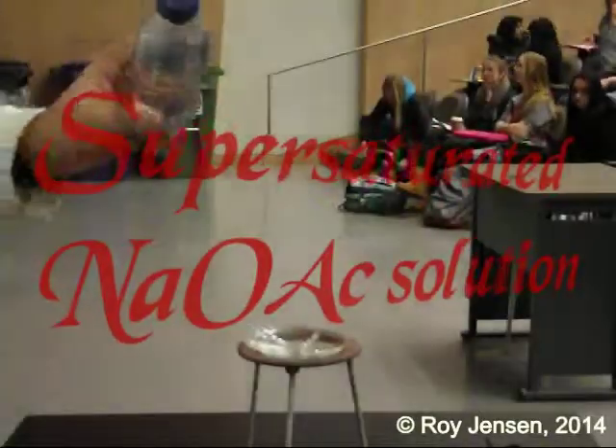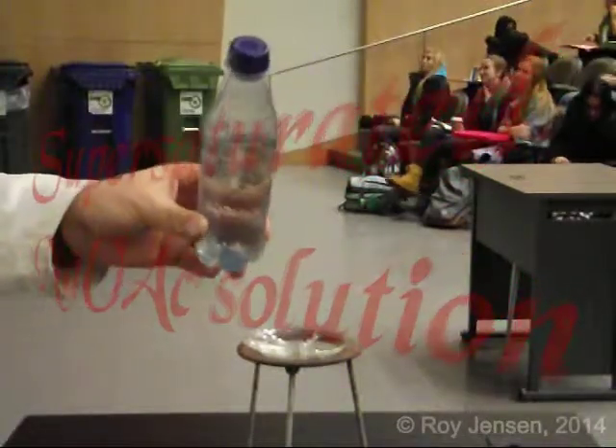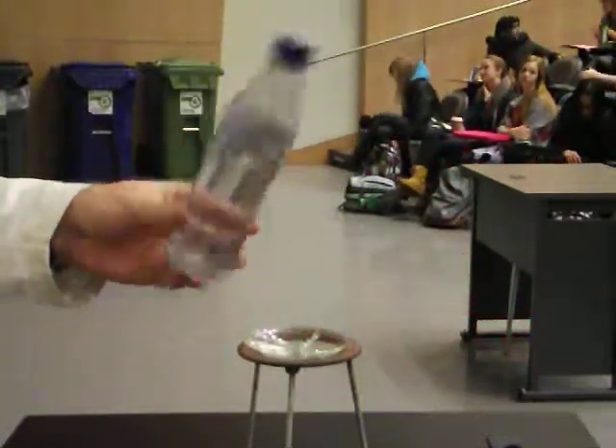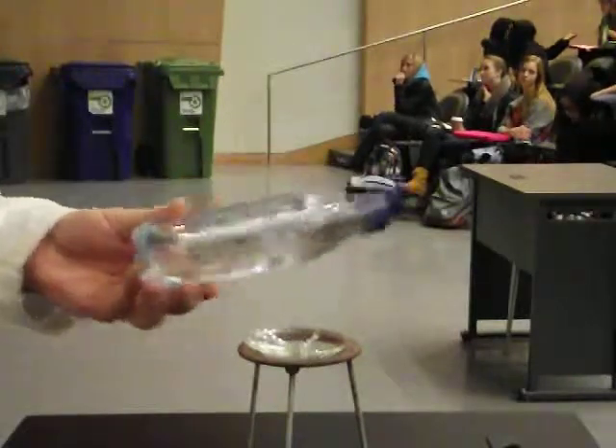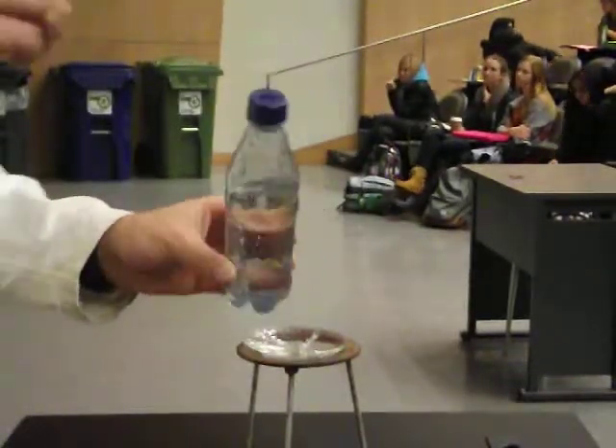When I give this demo to students, I talk about this as a safety lesson about not putting chemicals in a water bottle. It kind of looks like water, it flows around, it's a clear colorless liquid, but it has an interesting property.